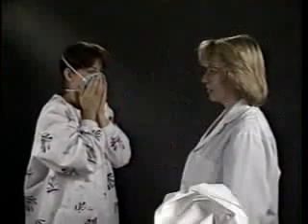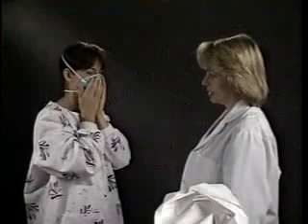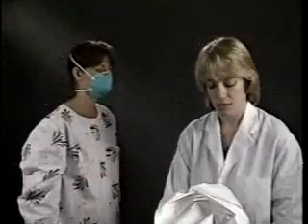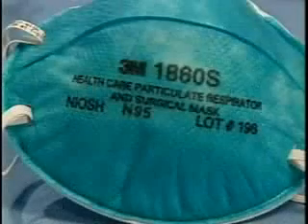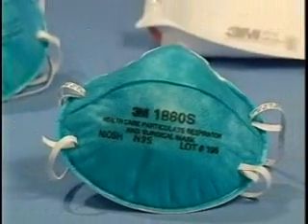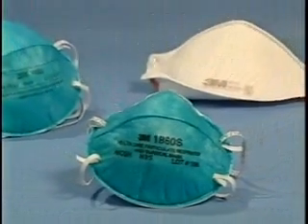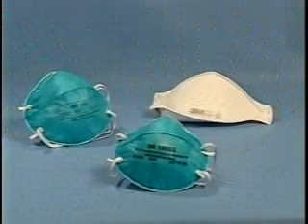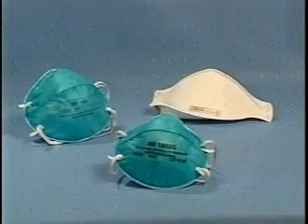Have the subject don and perform the user seal check as instructed in the fitting procedures for the specific respirator. We are using the 3M 1860 Healthcare Particulate Respirator, type N95 for demonstration purposes. You will also use the 3M qualitative fit test as the appropriate fit test method for the 1870 3M Healthcare Particulate Respirator and surgical mask.